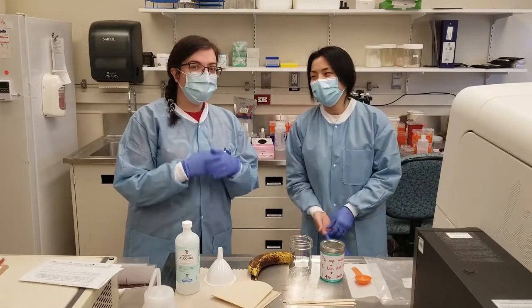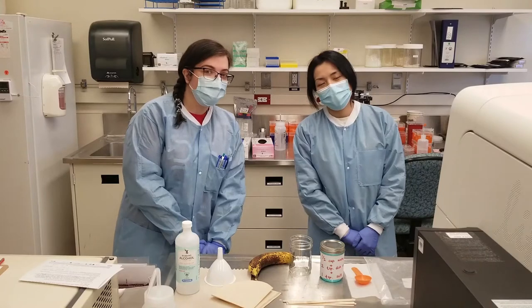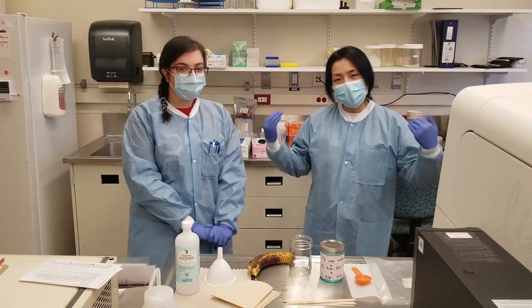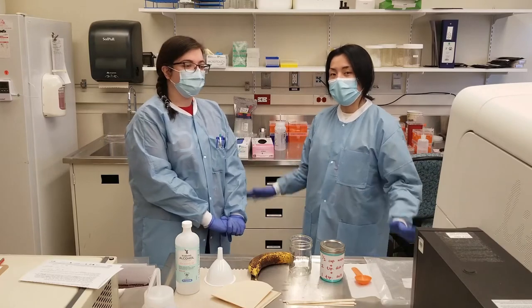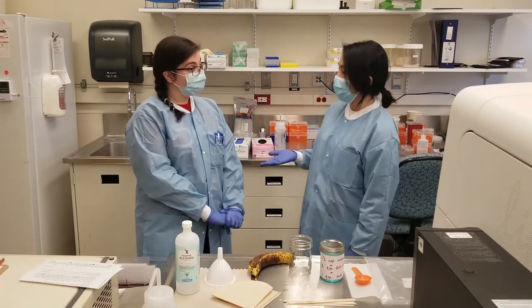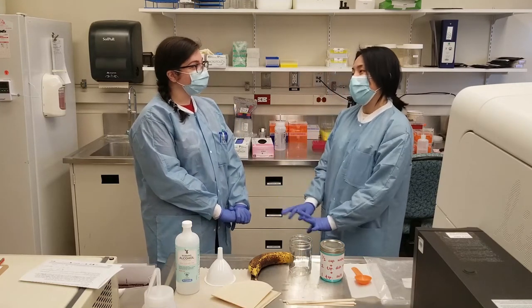Hello. My name is Christine. My name is Michelle. And we are MLTs at Sunnybrook Health Sciences Center. So currently we're in the molecular lab, and right now we're in one of the rooms where DNA testing is performed. And today we are going to extract DNA from bananas. So Christine, what is DNA?